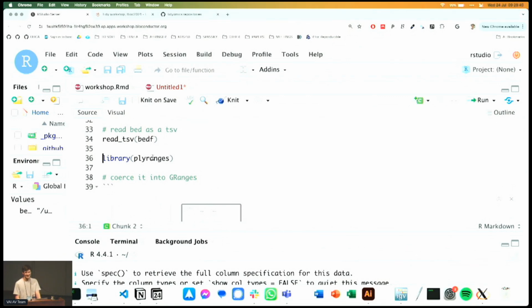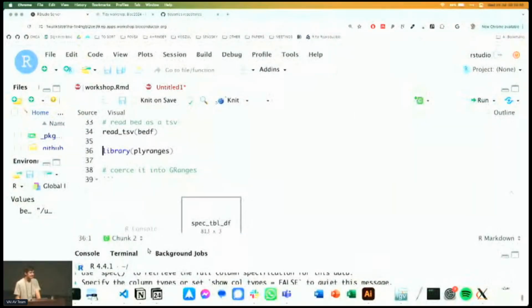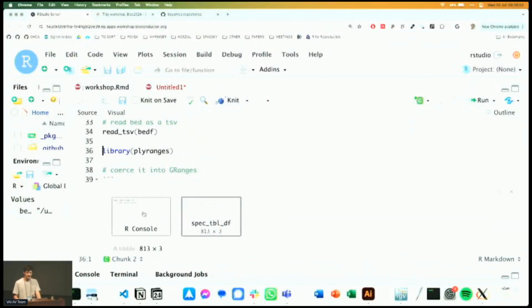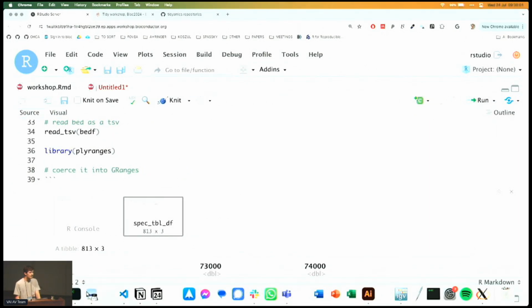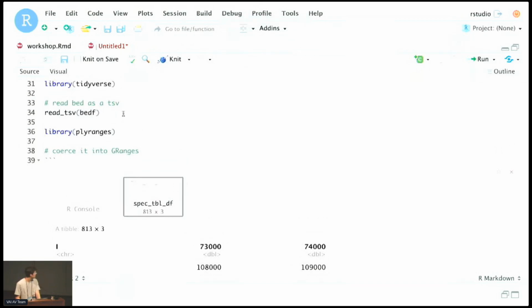I don't have much space anymore to show the result of each command, but that's all right. Maybe I don't. Low resolution. Yeah. Okay. Yeah. So hopefully now it's better. Let me know if it's not. Maybe I can shrink that. I don't need. Okay, everything is taking place. Oh, I could. Yeah. Thank you. It's a little bit bigger. Okay.